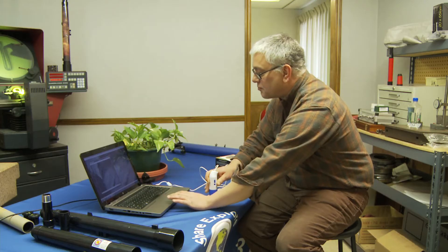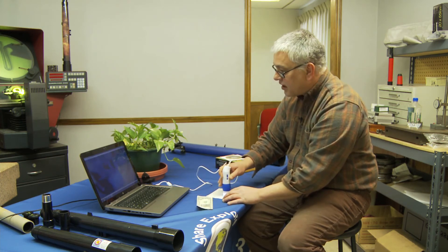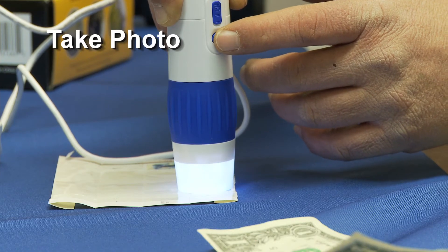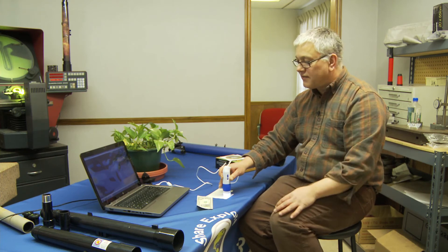I can save these pictures wherever I want to on my computer. I can take a picture of anything I want to simply by pressing that button. And pretty much like any other piece of software, you just find where you want to save it and you save it there.